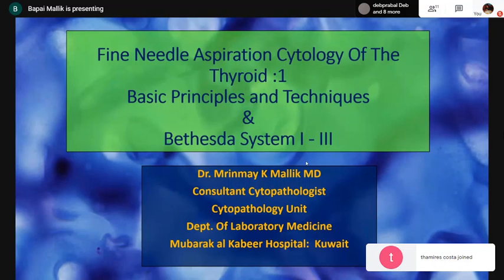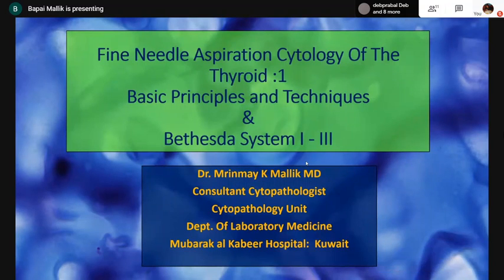So the topic of today's webinar is fine needle aspiration cytology of the thyroid. This is the first of the two webinars that I intend to do. And in this one, I'm going to talk about the basic principles and technique of fine needle aspiration cytology of the thyroid. And then we'll move on into the Bethesda system of reporting. And for this particular webinar, I shall be dealing with Bethesda's 1, 2, 3, and actually I'll add one more, 4. So this particular title is not correct. So I'll be doing Bethesda 1 to Bethesda 4.